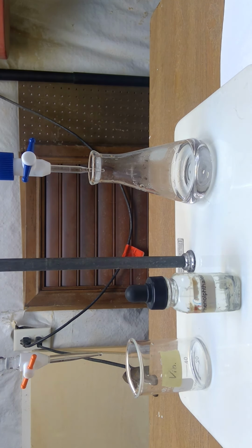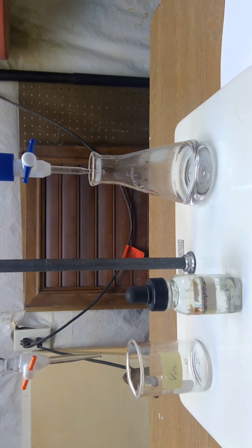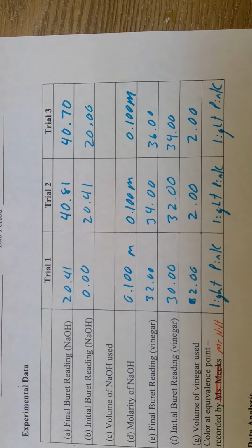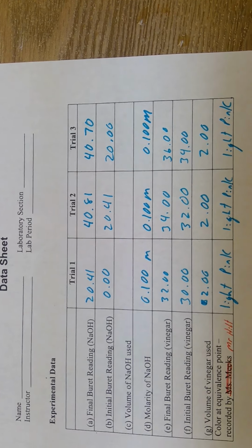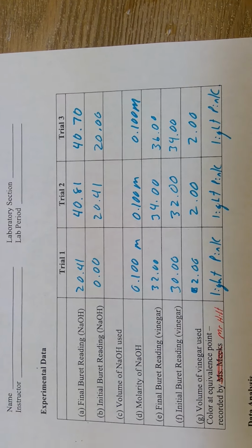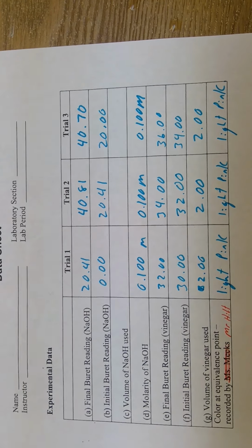The molarity of the NaOH was 0.100 molar. Okay, so now I want to show you the data table here that I made, and you're going to have to subtract your volumes of NaOH. Okay, so you can do that. So this is what I have. You can type this up. Right, and you're going to have to subtract your volumes to get your used NaOH.